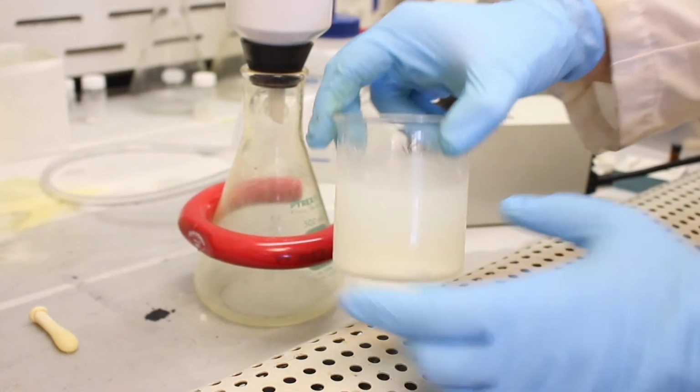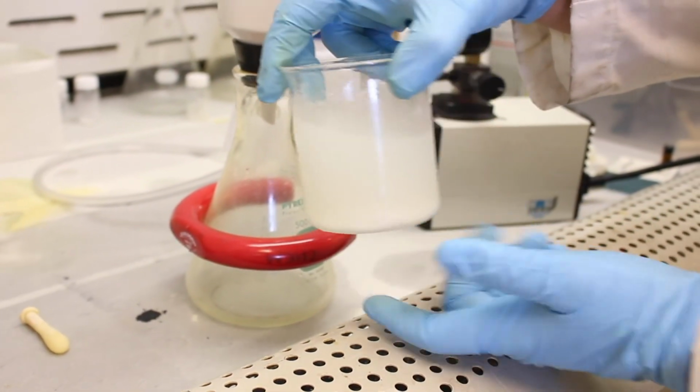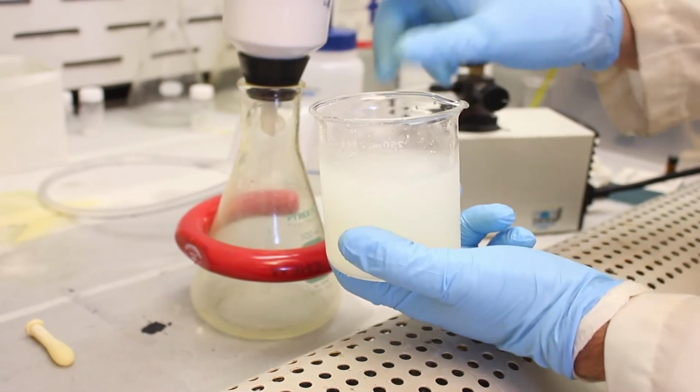Okay, so we have our mixture here. All the ice is melted, so now we're just going to collect the solids using vacuum filtration.